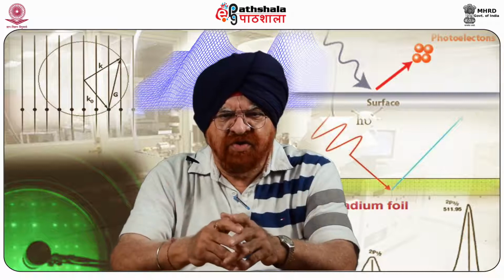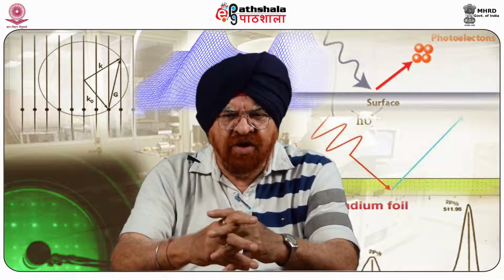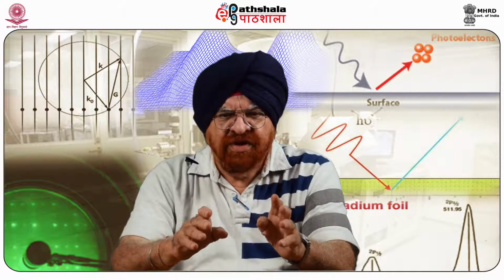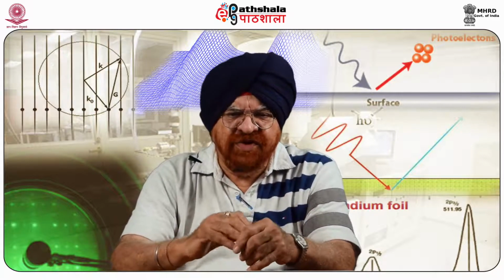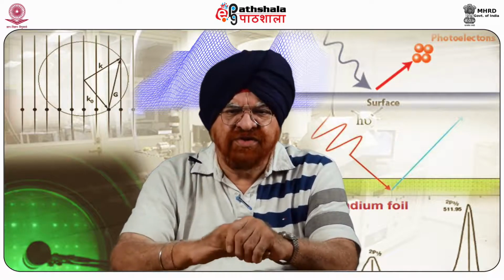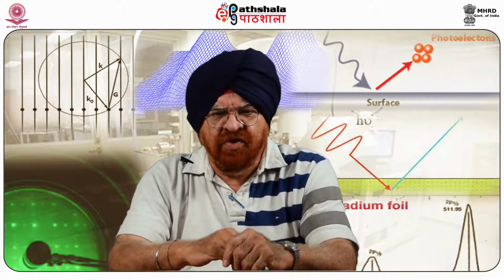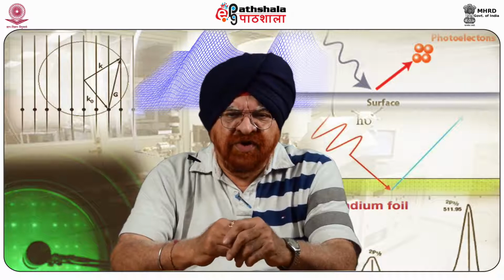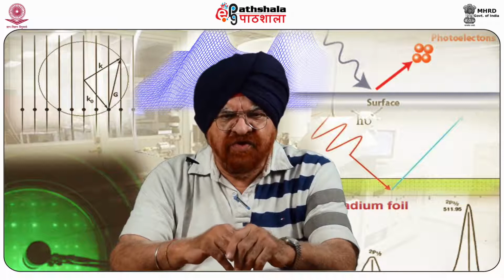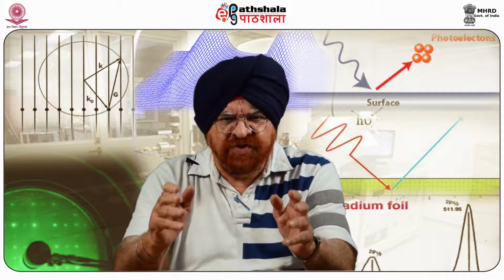Obviously, that is an electron kinetic energy analyzer, and photographic plates to record broad bands of emitted electrons as a function of velocity. In effect, recording the first XPS spectrum was the main thing in this. Continuing with this historical background, in 1954, the first high energy resolution XPS spectrum was recorded, which was of cleaved sodium chloride, revealing the potential of XPS.